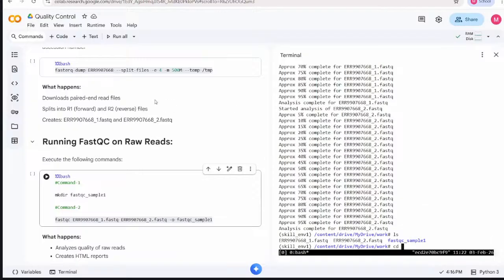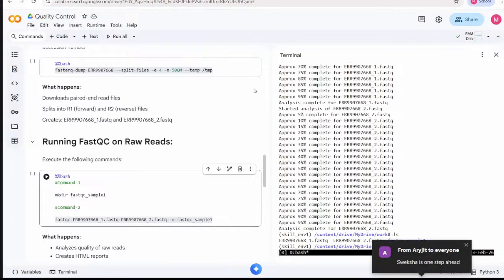You can just check whether there are files in your fastqc directory or not. Okay, Apnil, you just need to go into your fastqc directory, cd. Sweksha is running fastp instead of FastQC. She ran it over that. I'm sorry. Sweksha, you need to execute FastQC, not fastp now.